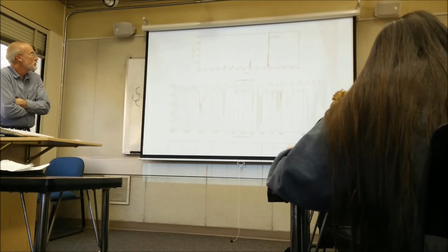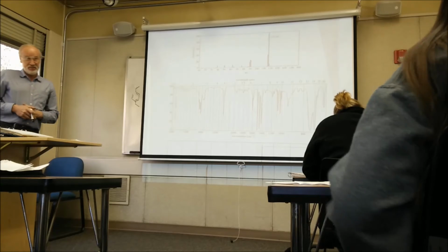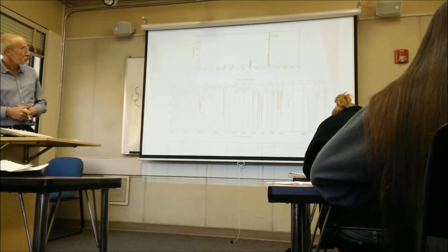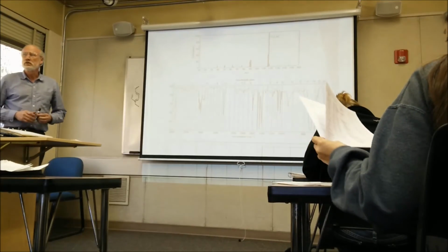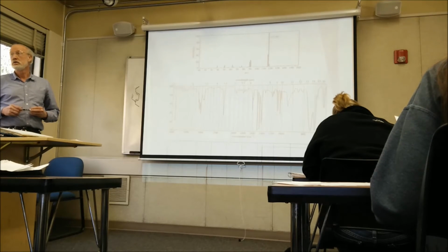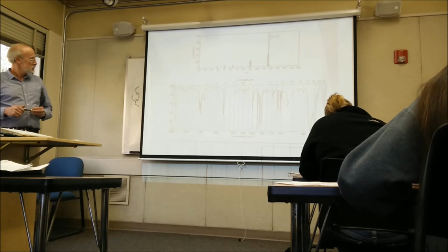And we've got ring characteristics. Yeah, and the NMR, with its peak just above 7, suggests we've got a benzene ring again. And then we've got 2 there. It probably is meta. 700 and 740, 45, something like that. Yeah, it could be mono substituted. The lines are at 737, yeah, that's a 750. So mono.